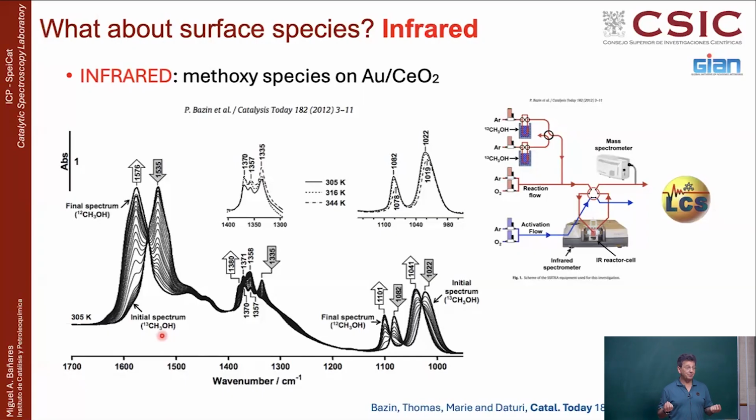And if you're looking at chemistry of methanol, it will probably be similar, and you will say, okay, infrared is much more sensitive and it will report more nicely with a better signal. This is true. But you will see that in the case of Raman, it is more sensitive to polyolefinic carbon deposits, and that the infrared is more sensitive to oxygen-containing carbon deposits.